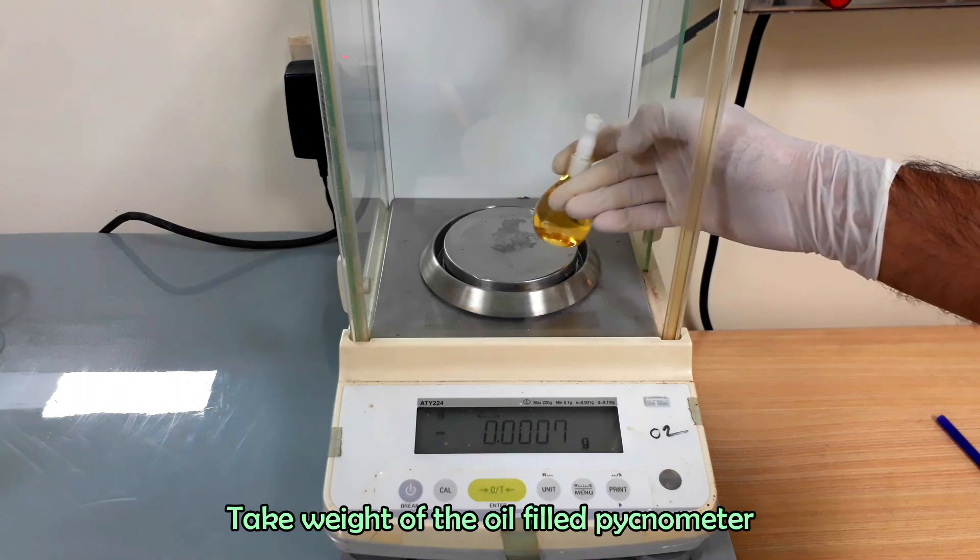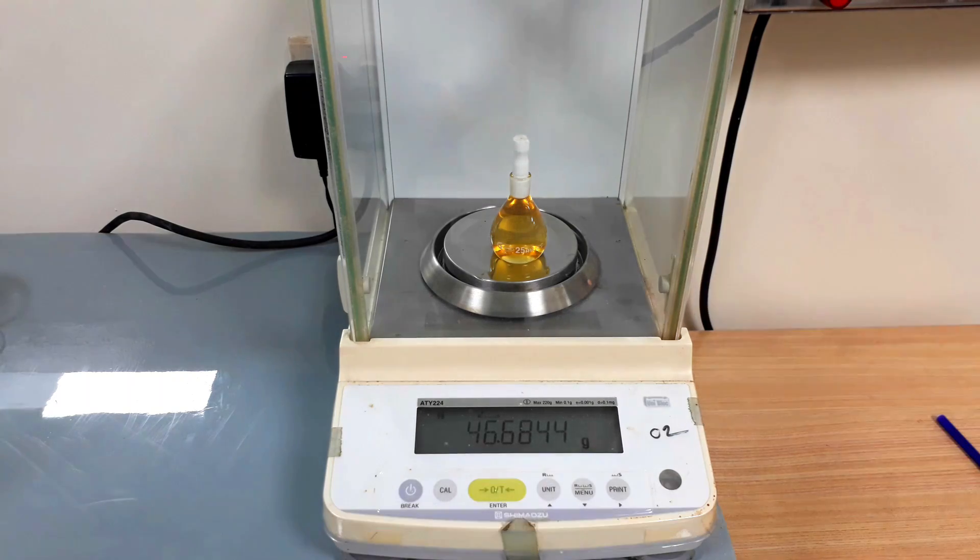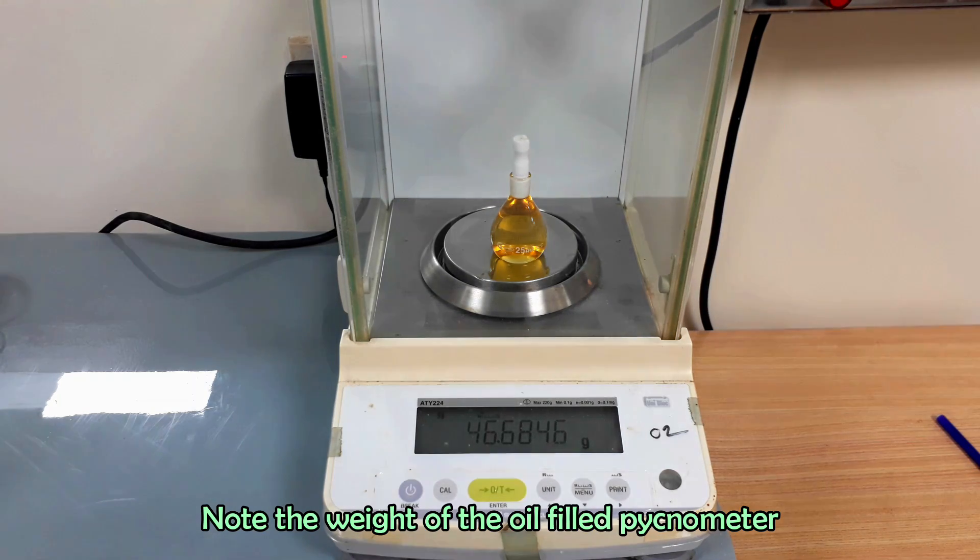Now take weight of the oil-filled pycnometer and note the weight.